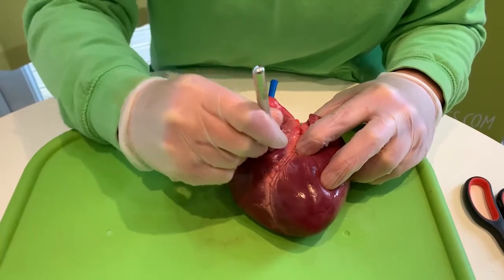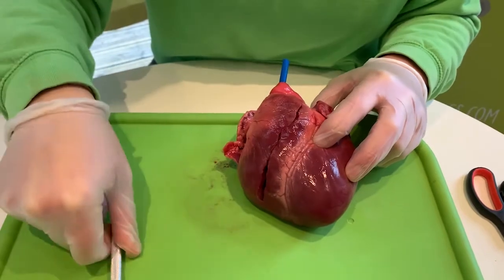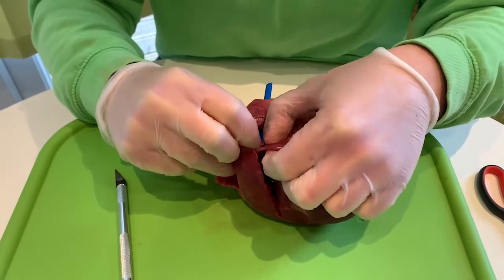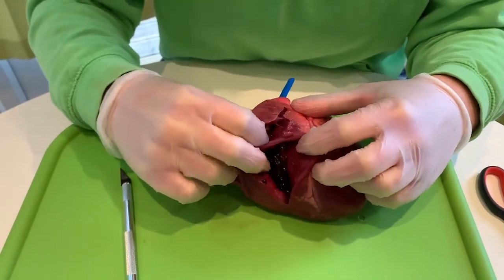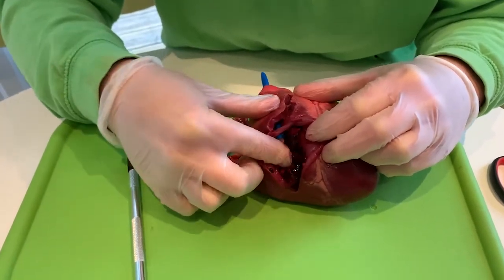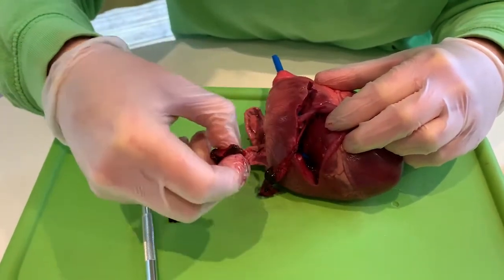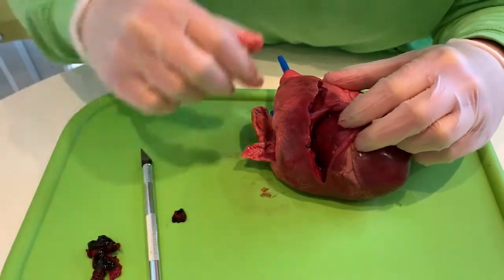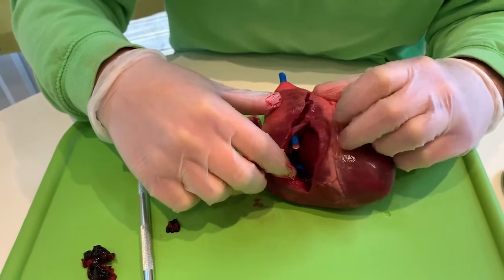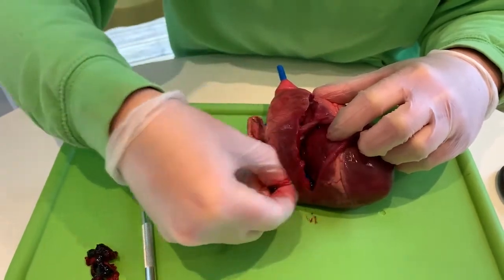I'm going to cut into the muscle, and we'll see if we've got our straws in the right place for that deoxygenated blood. So as you can see, it's quite thick. Oh, look at that. And inside of here, we have got some blood clots, okay? Take those out. And this is often what happens after the sheep has died, okay? Often the blood, because it isn't getting oxygen anymore, will just clot, okay? So sometimes there will be blood clots in the heart.